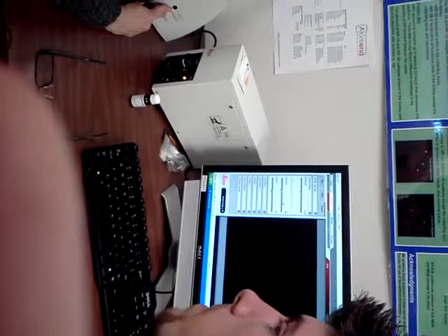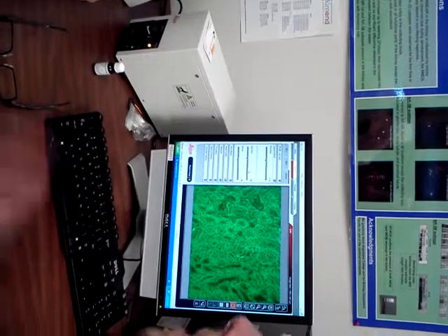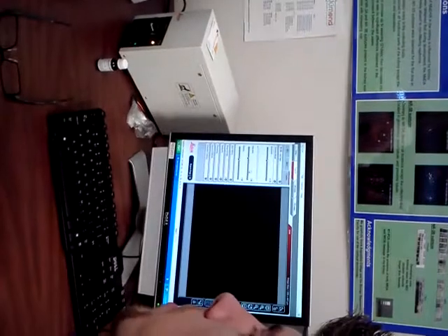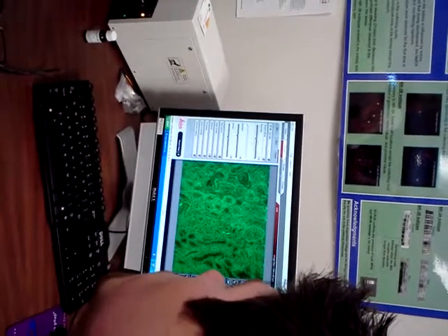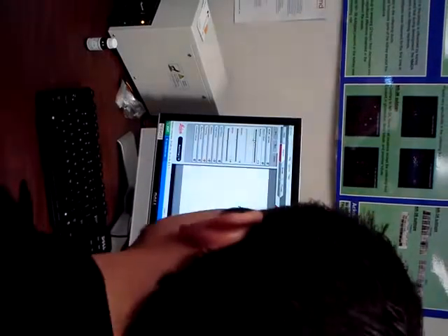Is this how I change it? Nope, that's just your fluorescent button. The one below that is your change key. I just wanted to know if there was any fluorescence that was here. There is a little bit here, but not a lot. And this camera isn't made for fluorescence. You can see we're fine because this is really bright. But in low light situations, this camera does not do very well. Actually, you do see it a little. I mean, you see the color. Yeah, exactly. And we're at a pretty low exposure time. I just wouldn't recommend using this for a lot of fluorescence.